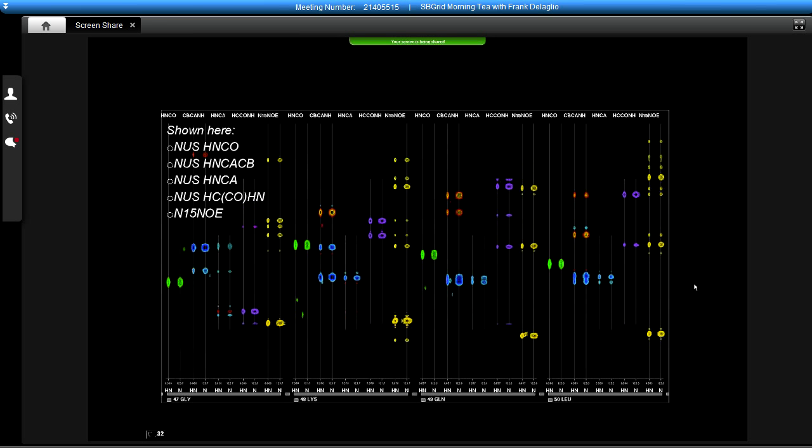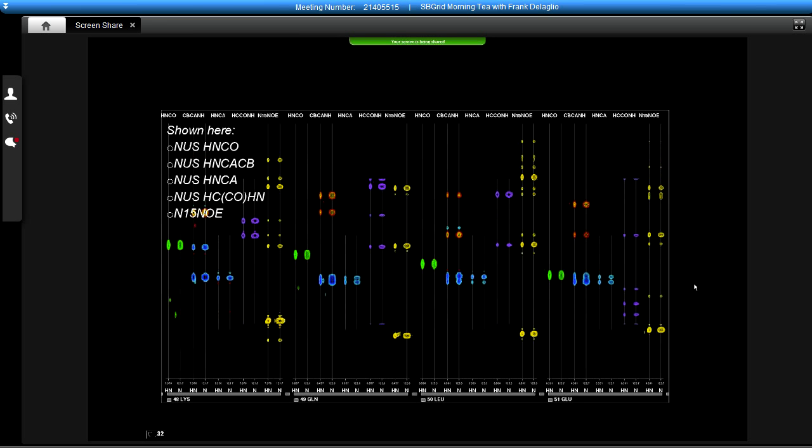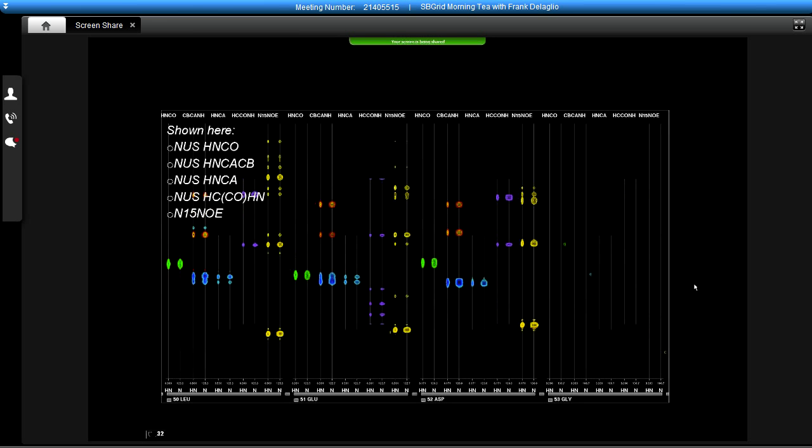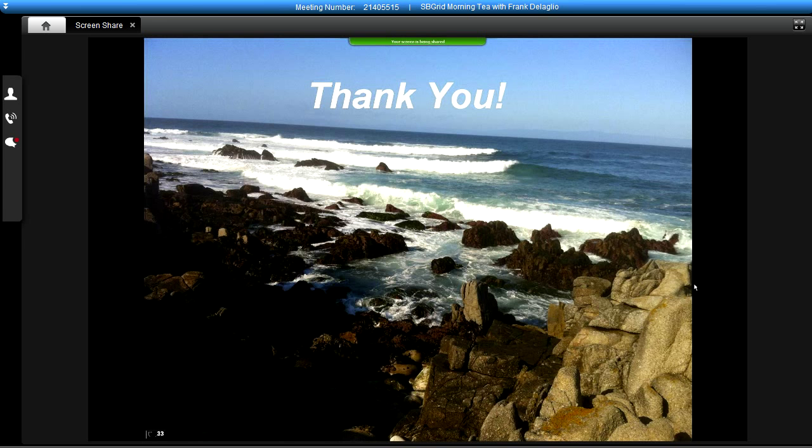And because this iterative soft threshold method is so straightforward, there are not really very many complicated parameters to choose. So it's easy to set up, and the results are very robust. So that's my summary for today. I hope it was interesting, and I look forward to your questions and comments today and also next week when we actually see how to use software to achieve results like this.